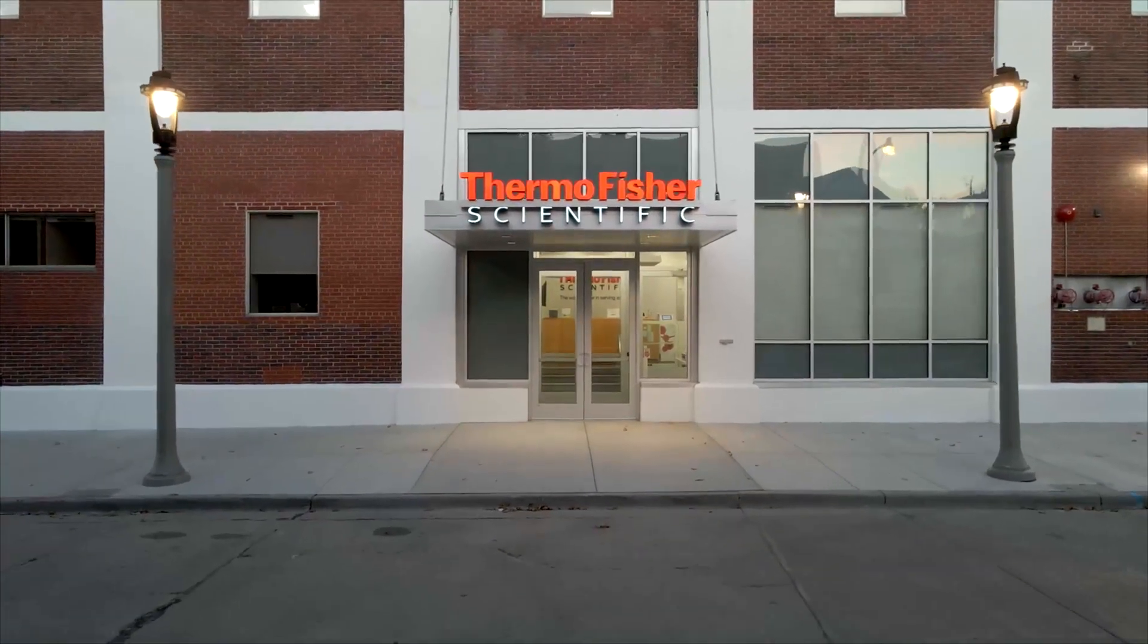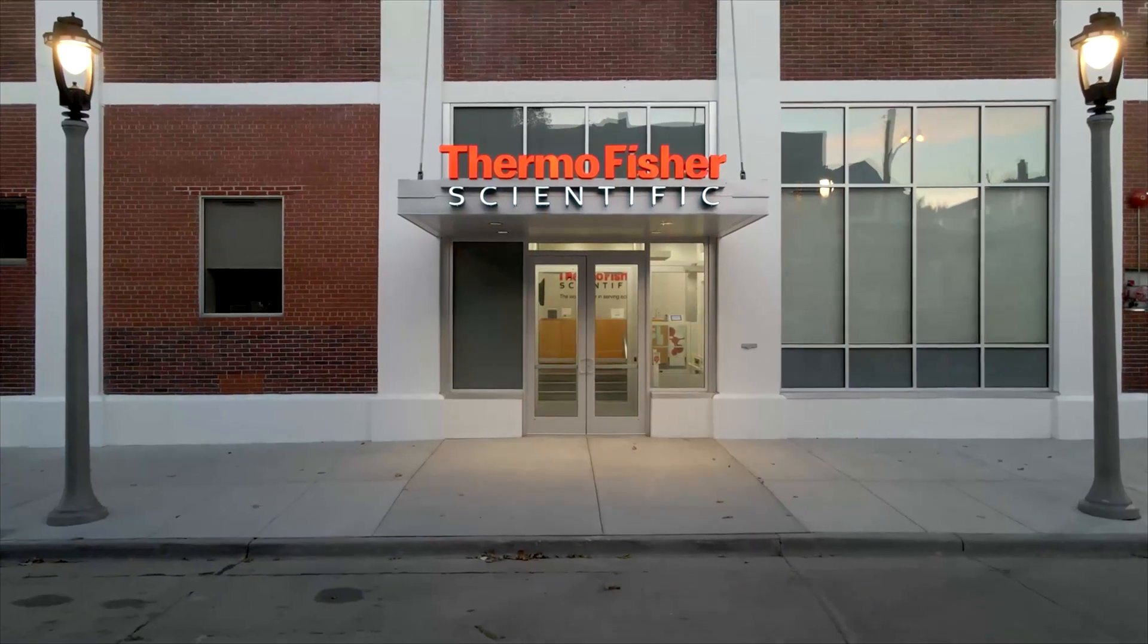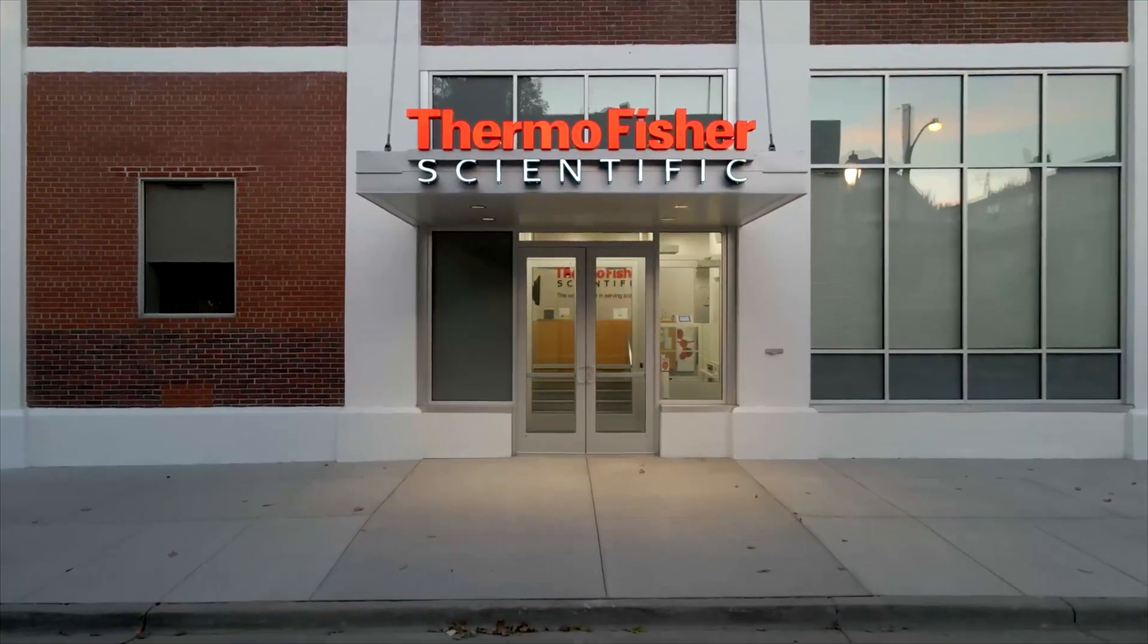Let's take a quick tour of our processes and facility to show how we are supplying you with products of high quality at scale.